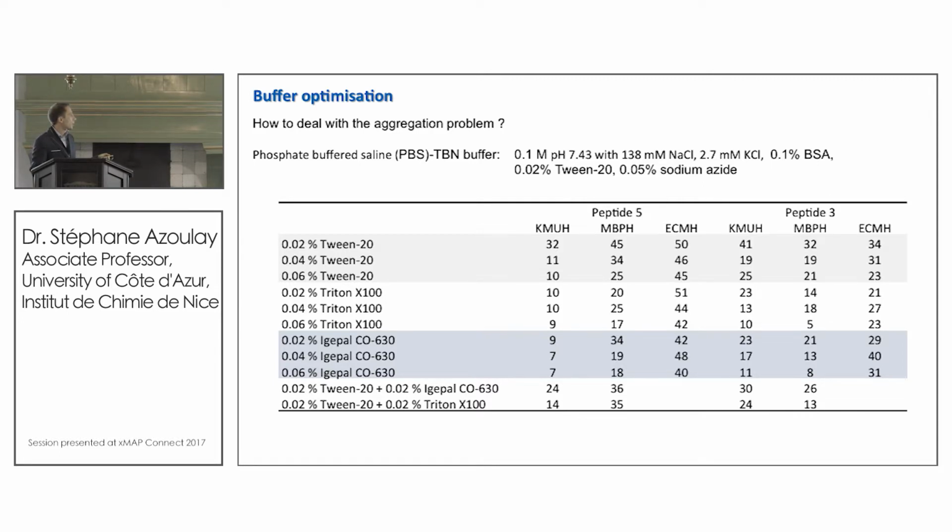As you can see, the apparatus reports an average of 40% aggregation, which is quite a lot and sometimes could block your analysis. It was different between the linkers for the same coupling ratio, and it was different between the peptides.